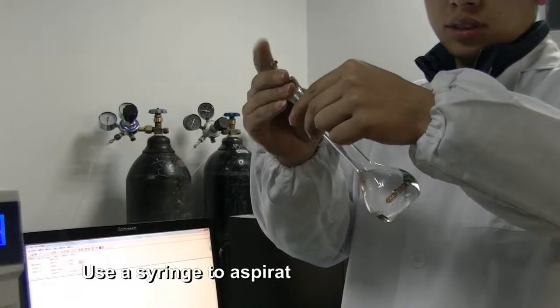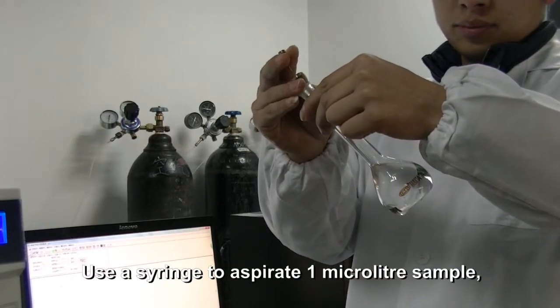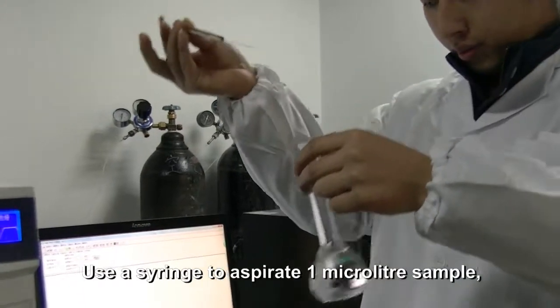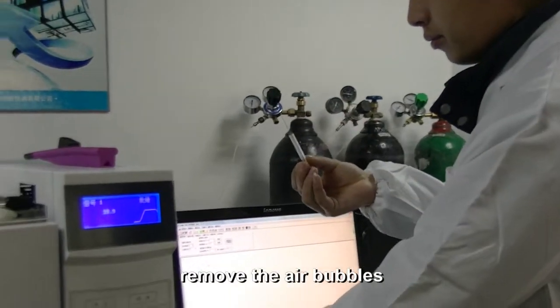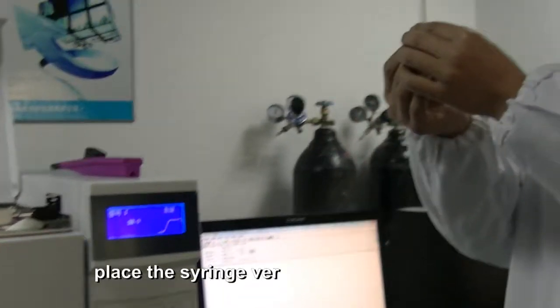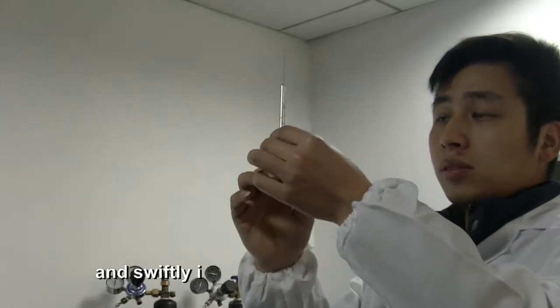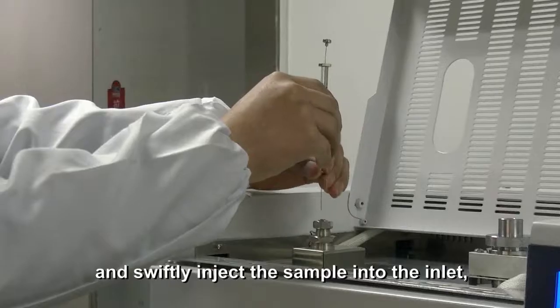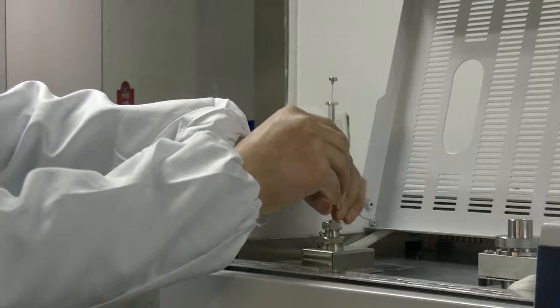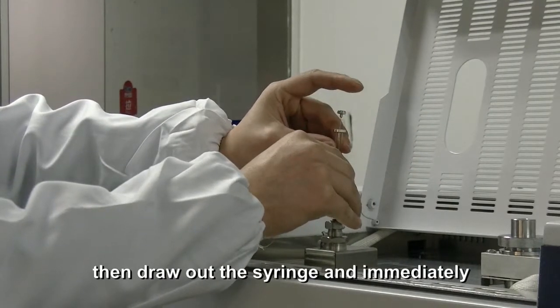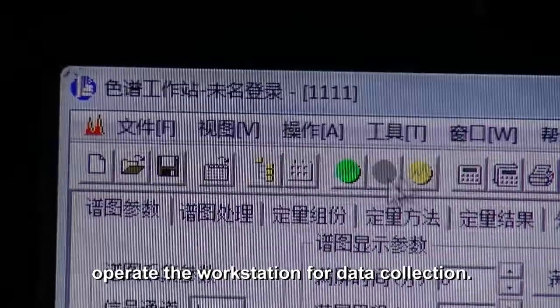Use a syringe to aspirate 1 µL sample. Remove the air bubbles, place the syringe vertically above the inlet, and swiftly inject the sample into the inlet. Then draw out the syringe and immediately operate the workstation for data collection.